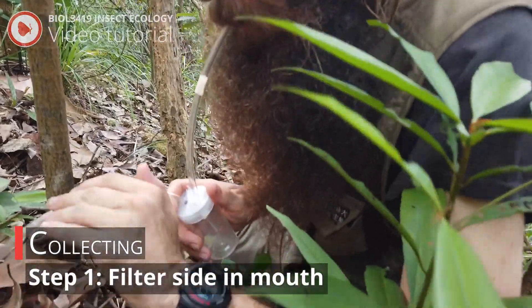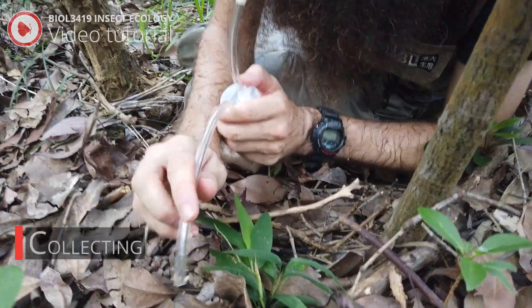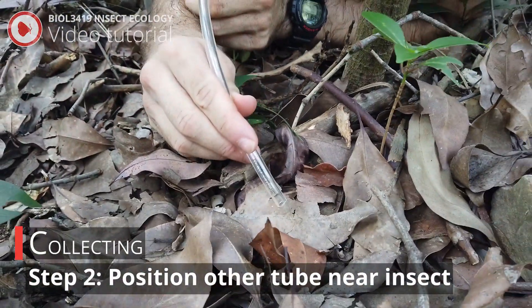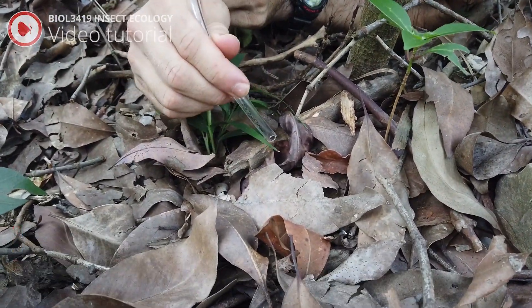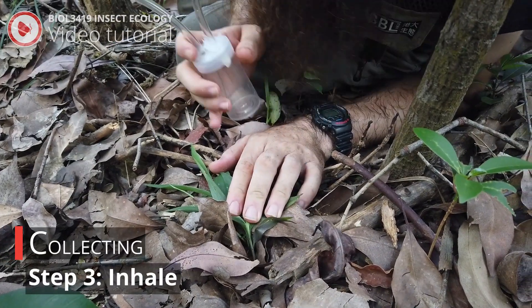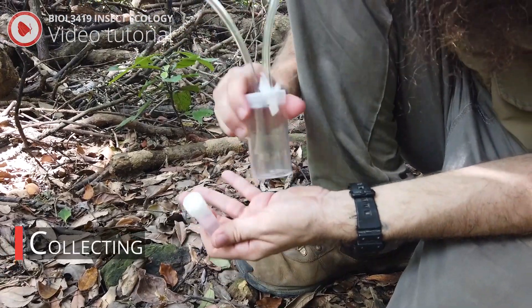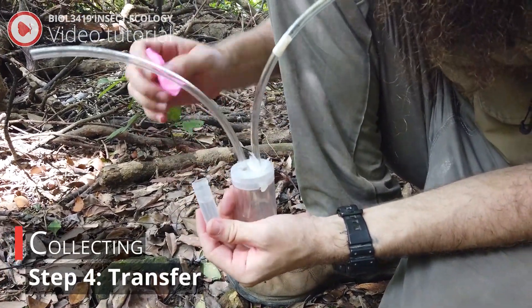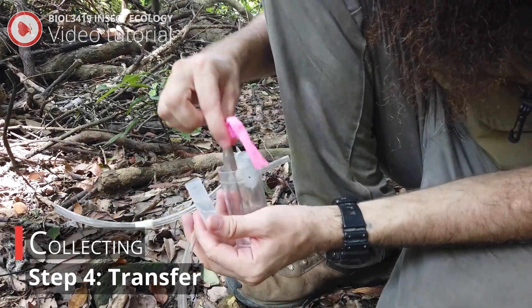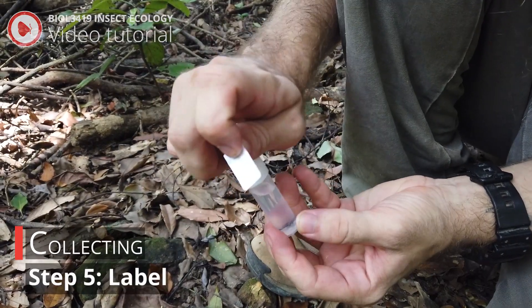Step one, place the aspirator tube that has the filter in your mouth. Step two, point the other tube without the filter at an insect you want to collect. Step three, inhale through the filtered end, sucking the insect into the aspirator container. Step four, move the collected insect to its own vial. Step five, add the label.